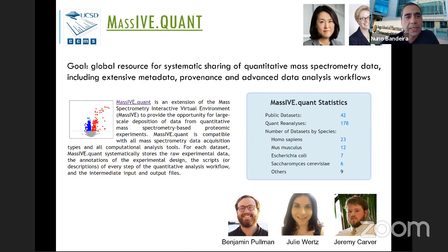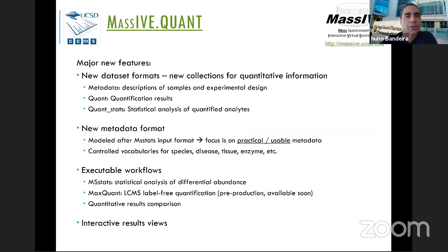So to give you a quick idea, and we'll go into more detail on this for the rest of the session, but just to give you a couple of points on the major new features of MassIVE-Quant. One major new aspect that MassIVE-Quant brings to the table is that there are new dataset formats where new collections are added to the dataset for quantitative information.